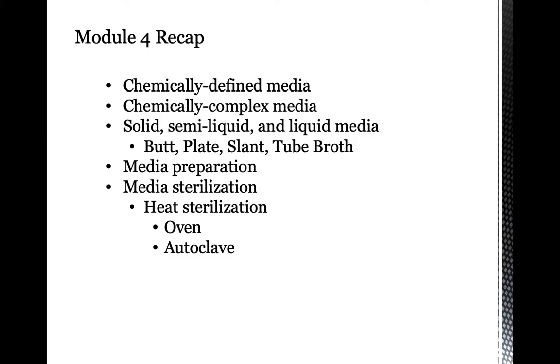In our lab, in face to face, in the usual setup, our culture media are normally lyophilized, meaning they're already powdered. Then you just have to get a total weight of your lyophilized medium, and then combine it with a specific volume of solvent that you need to prepare the total preparation. In the process, we follow standard formulas for the different ingredients and the total medium for the case of lyophilized medium.